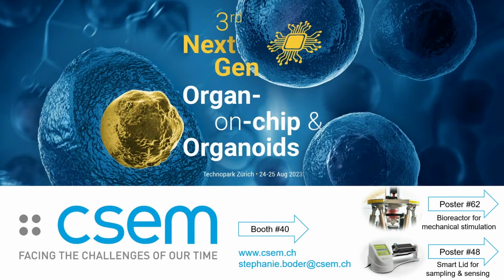The way we did it was we used a standardized plate from the company Kugelmeiers, where you have microwells and you mix the cells in defined ratios, and then you can form the organoids in a very standardized way.